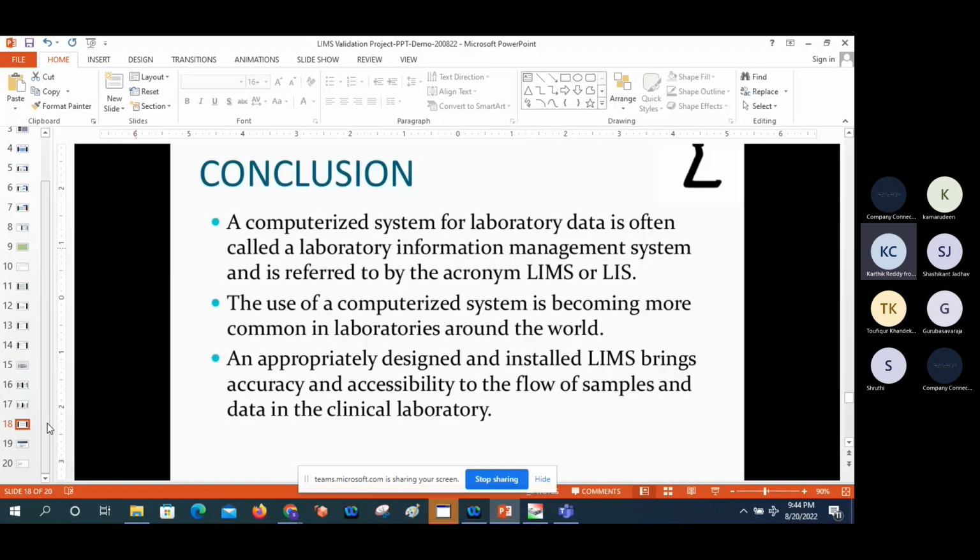And coming to stability, how to create the stability data like protocols, test articles, and other workflow. And for example, environment monitoring is there, like microbiology, how we can create the master data for that. So these kind of things I will explain.